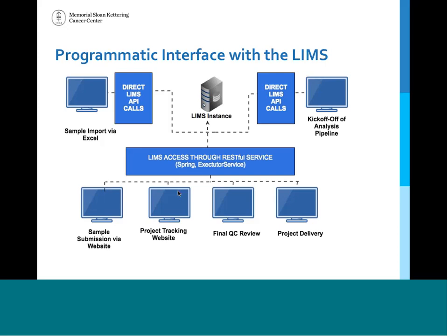So this slide is just detailing how we have our LIMS instance set up both to receive information via an Excel or via a sample web form and have it then push information out into the pipeline, and how we can also access information about the samples through different RESTful services.